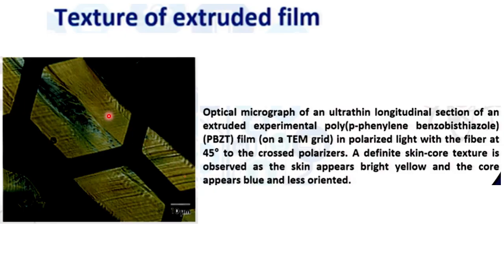Now based on the surface roughness of the skin, of course there must be changes in the property, ultimate mechanical or other final properties. So to modulate the extrusion conditions or different parameters, for example temperature or speed, you can verify that with the help of the optical microscope.